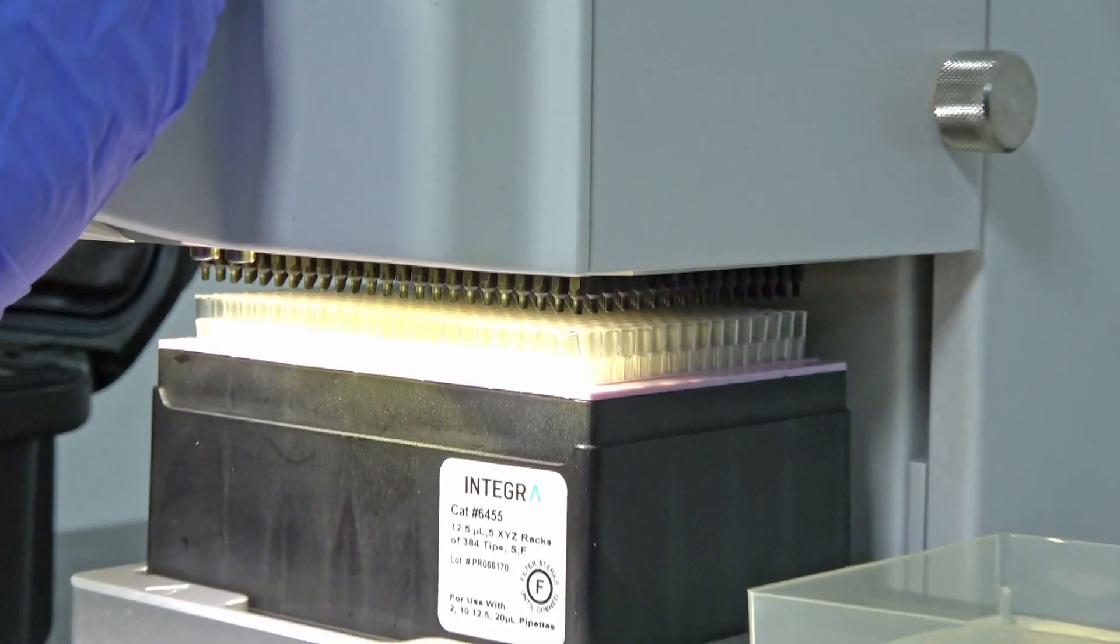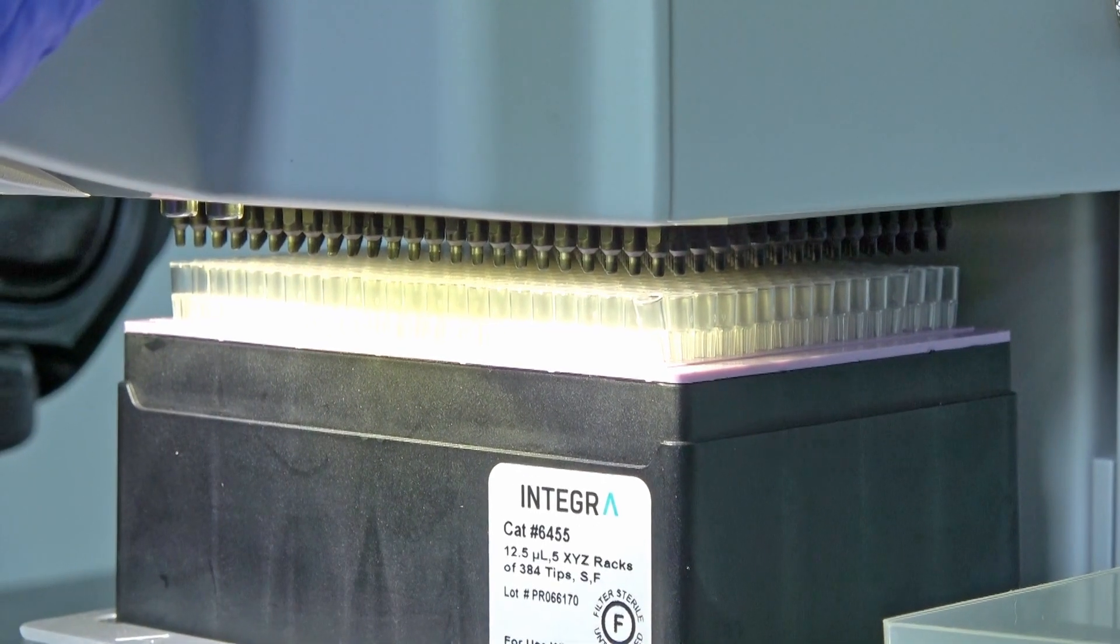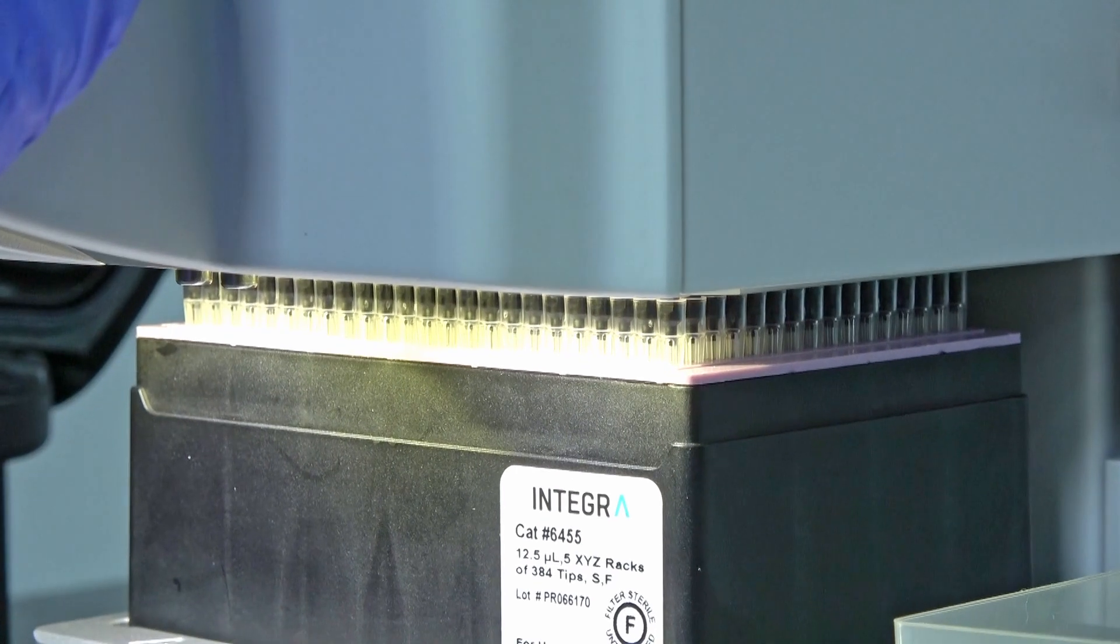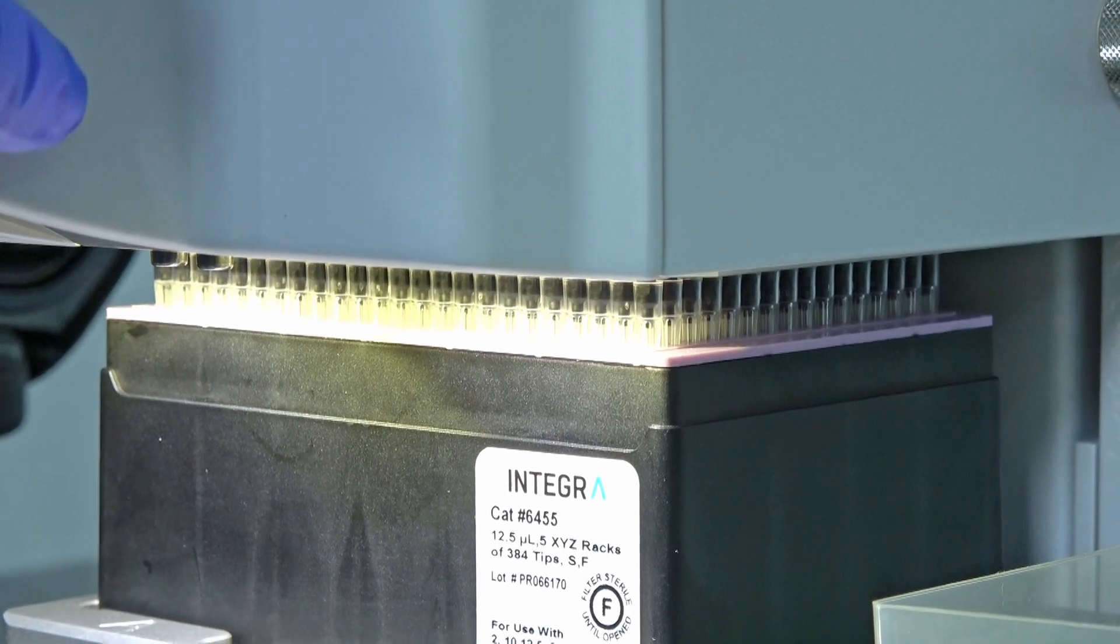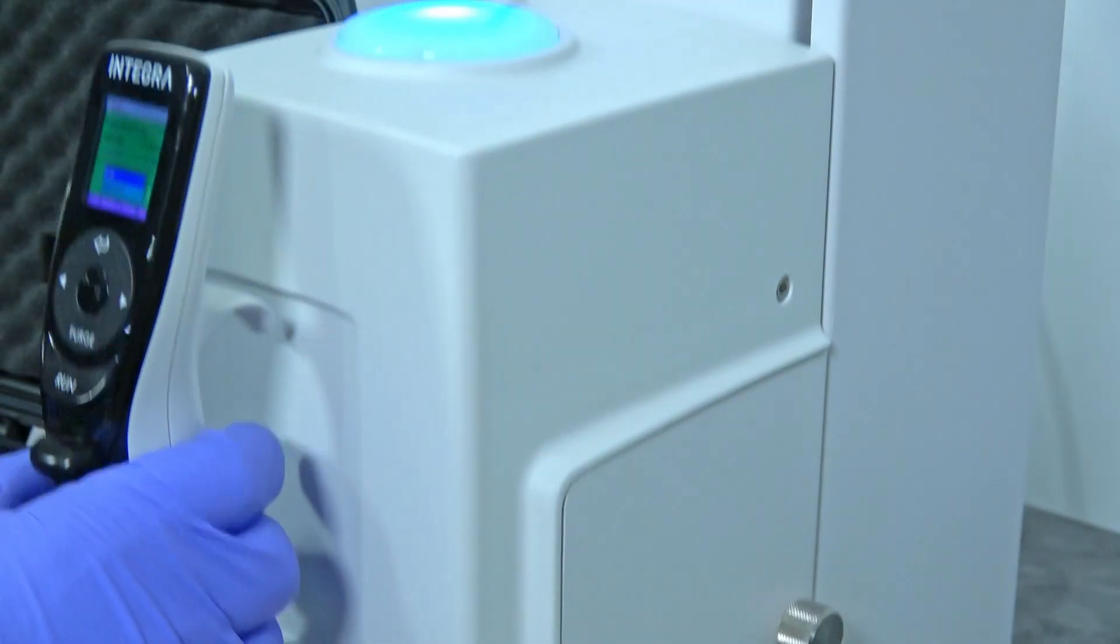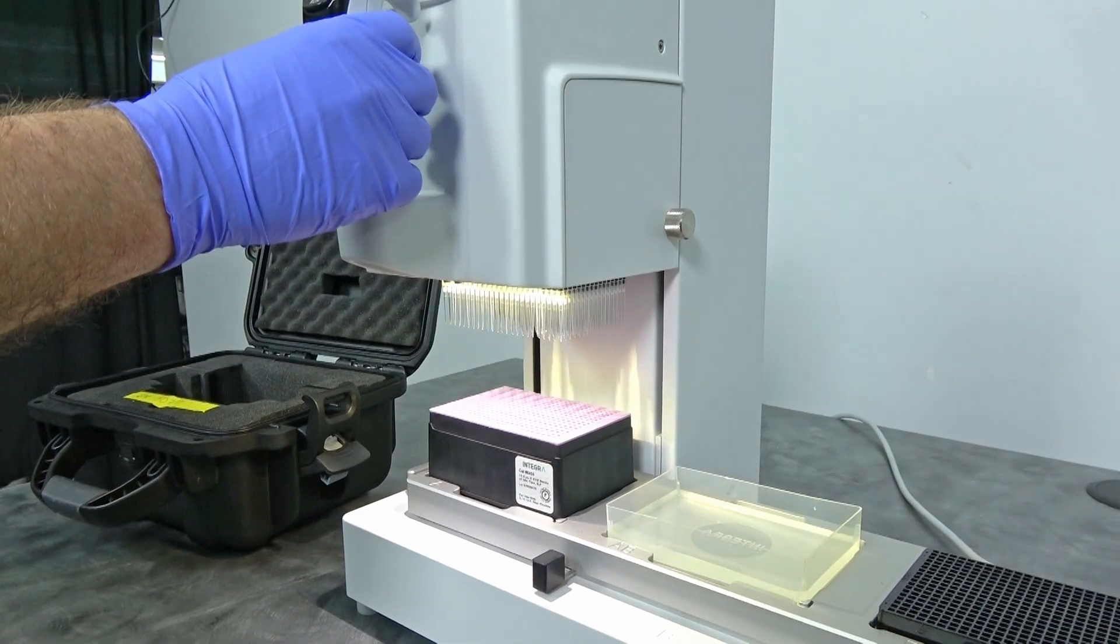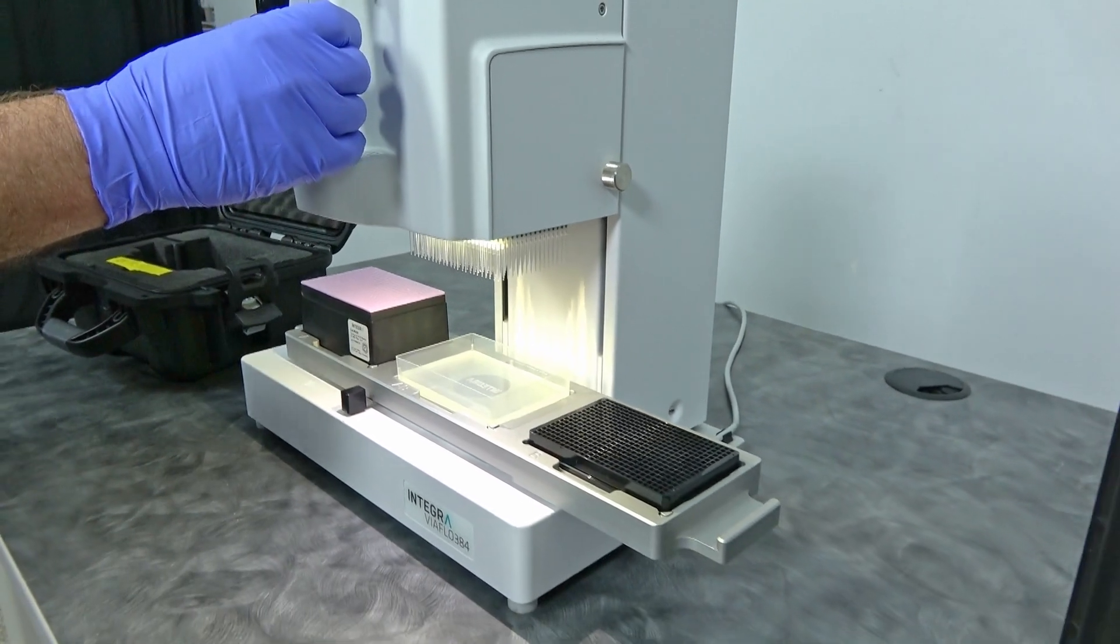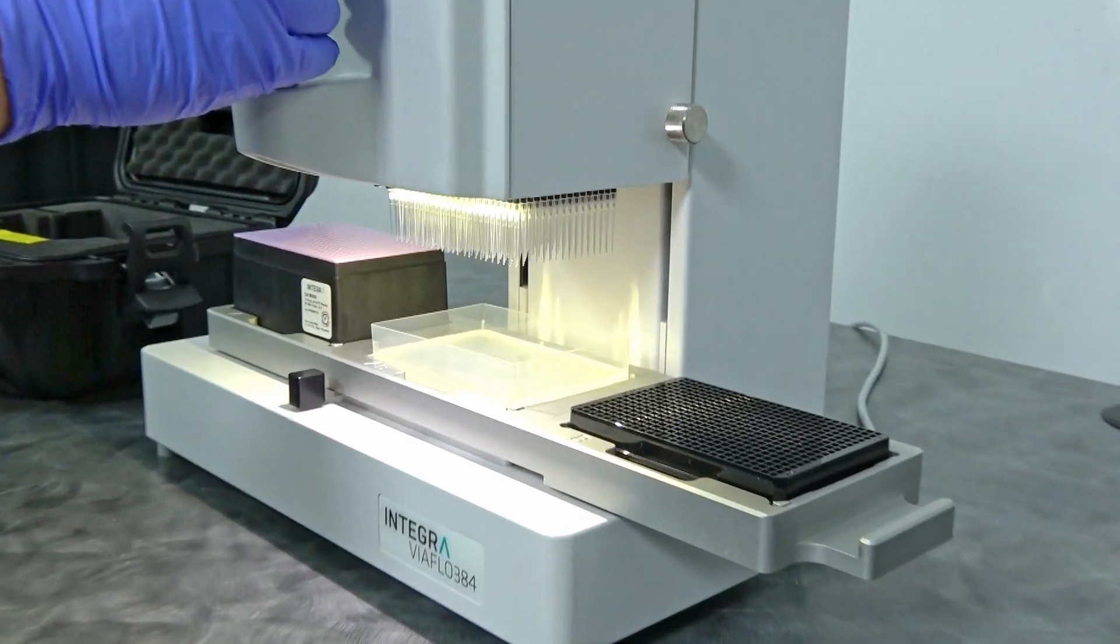We're going to go ahead and load the tips first. Get it down here, and we want to line it up. Once it's lined up, we're going to go ahead and hit the button. And that gets us loaded. So the machine actually does the last initial press when it loads the tips, so you're not pushing down on the machine. It does it for you whenever you hit the top button.